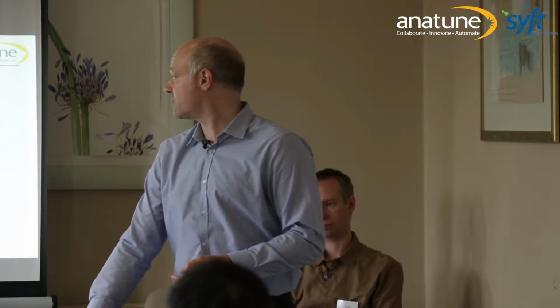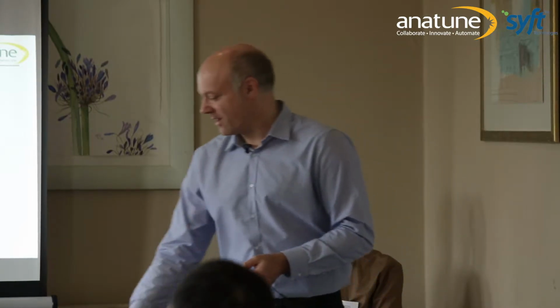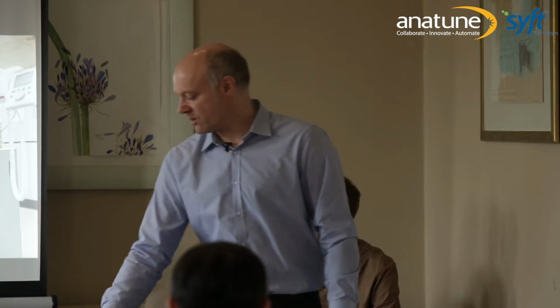So we'll move on from this slide here, which is just some numbers about how you do gas phase analysis, which hopefully, if you all do it, you should know how to do. And we'll move on to the validation. So the question here is, how do we validate SIFT-MS methods? Well, for GC and LC, there are guidelines out there already, particularly for pharmaceutical type validations, which are basically the ICH Q2 guidelines, the International Council for Harmonisation, which provide the framework for doing method validation.